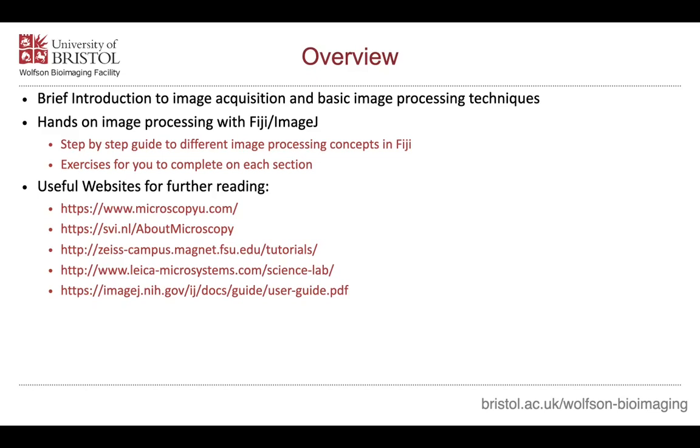Also on this slide, we've just got a few useful websites for further reading. There's the Nikon MicroscopyU website, the SVI Huygens website, which has a lot of really good detailed optical diagrams and descriptions of microscopes. There's the Zeiss and the Leica. You can't have one without the other. And probably the most useful website is the bottom one, which is the ImageJ NIH user guide. That is really the complete Bible of ImageJ that we would recommend you download and have a look through before really cracking on with your own image processing.